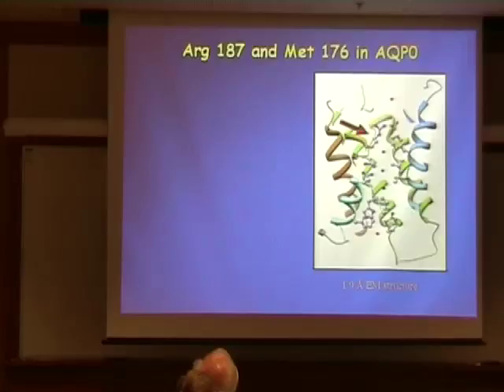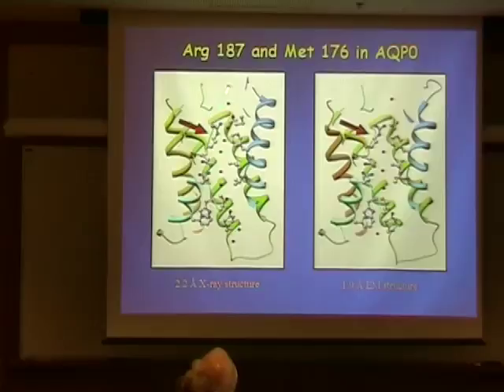So this is the arginine in our closed AQP0, and this is the arginine in the open AQP0, and you can see it's exactly the same conformation. So what this means is that the conformational change of this arginine can actually not be the cause of opening and closing the water pore in AQP0. There must be some other mechanism.